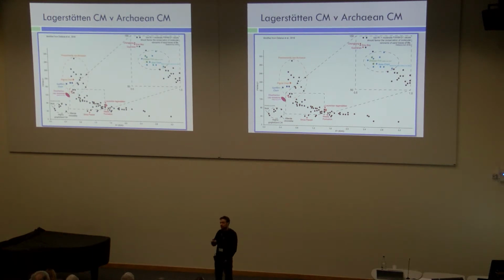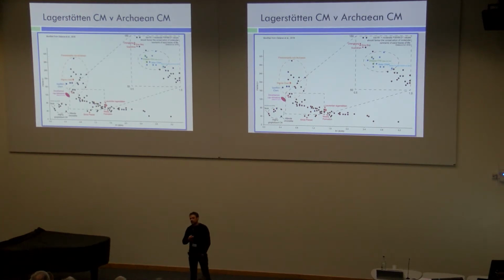Since there was no other Cambrian data to really compare this with, I went to the Archean record because this is where predominantly Raman has been utilised. And Raman is utilised in the Archean world to look at the thermal maturity of sedimentary basins, to look at the structural order of the carbon, and to identify the best areas to look for traces of life. That's what they're using Raman for. And this is called the Carbonization Continuum that was done by Delarue last year.